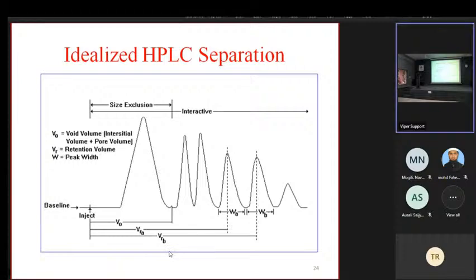For small molecules we can handle them with a UV or PDA detector. For proteins, for large molecules, we use mass spectrometry, which has positive ion mode and negative ion mode, and you can go even to 15,000 or 16,000 molecular weight. Also, the major problem with proteins is energy. They are very sensitive molecules. Small organic molecules are very stable, while proteins are much less stable.